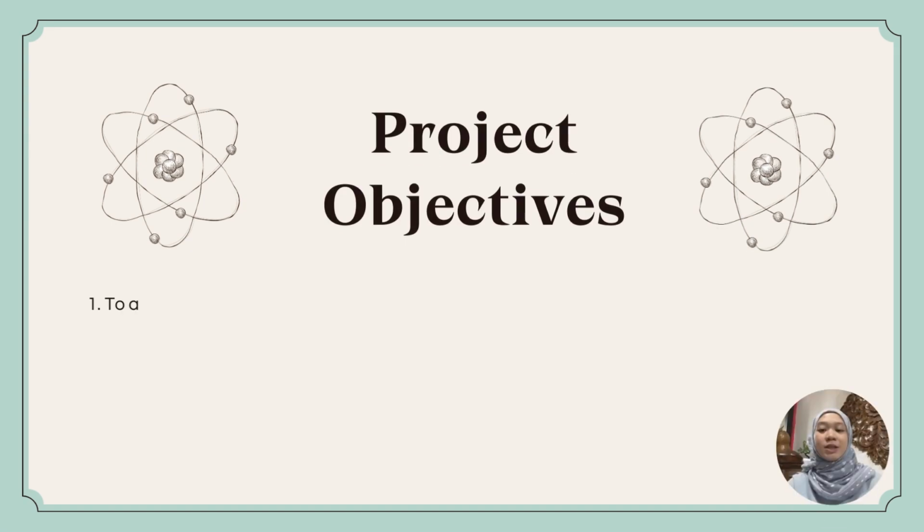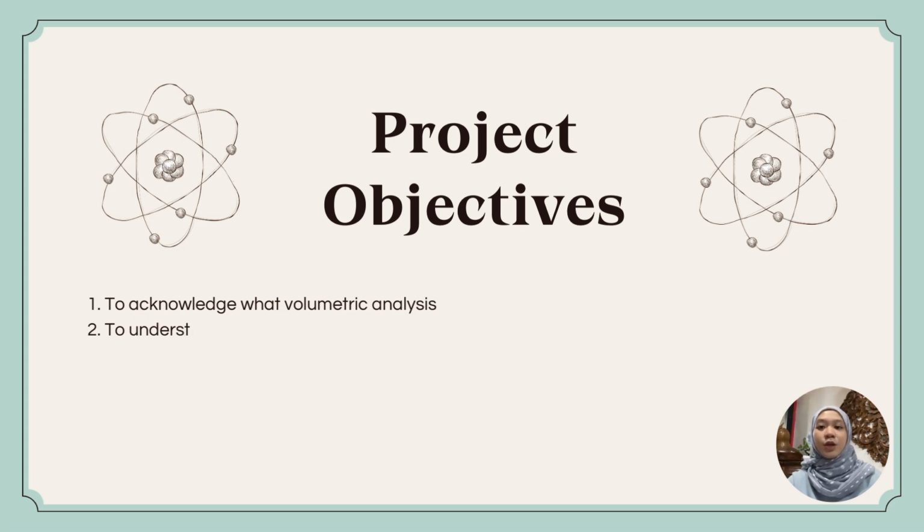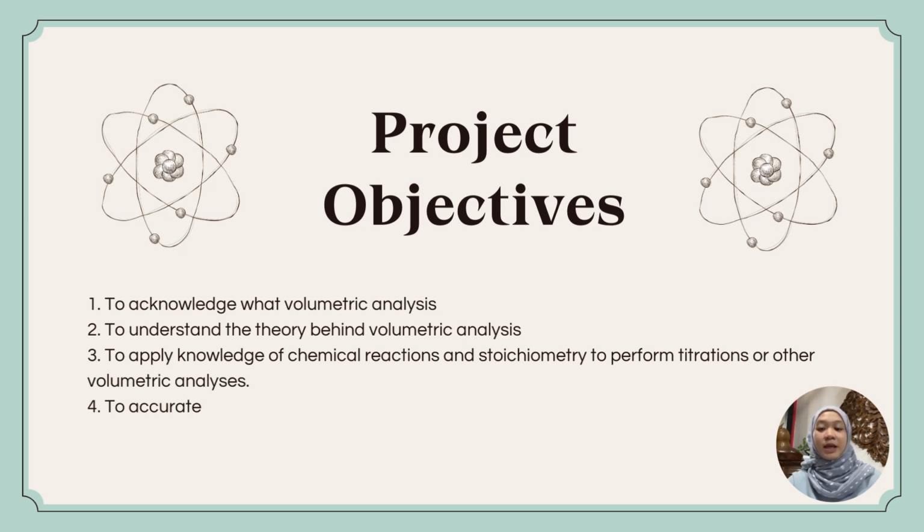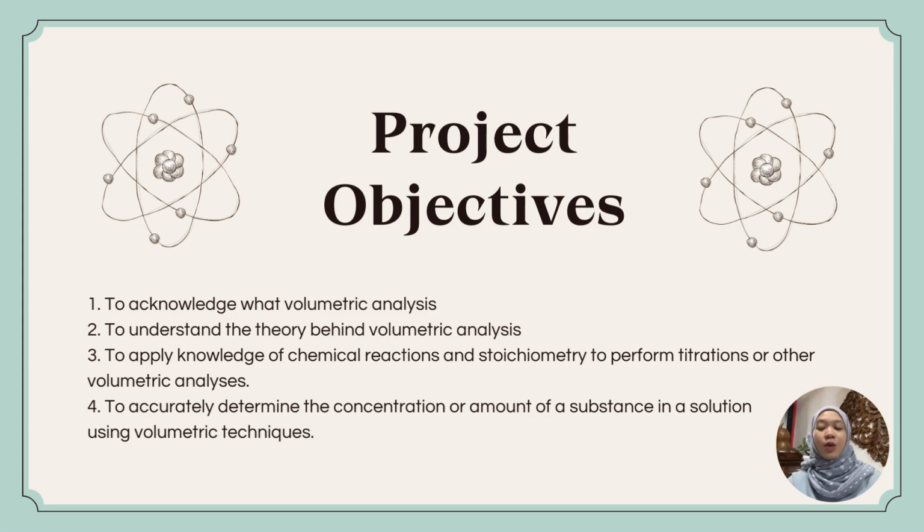So, let us start our presentation with the project objectives. First, to acknowledge what volumetric analysis is. Second, to understand the theory behind volumetric analysis. Third, to apply knowledge of chemical reactions and stoichiometry to perform titration or other volumetric analysis. And lastly, to accurately determine the concentration or amount of a substance in a solution using volumetric techniques.